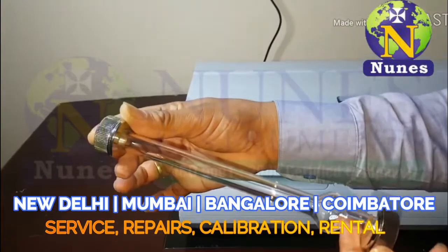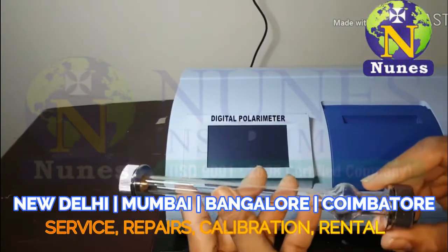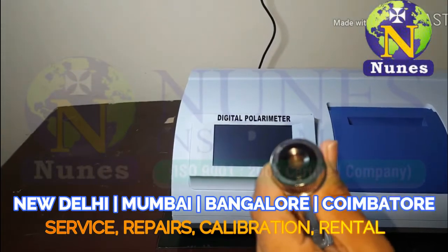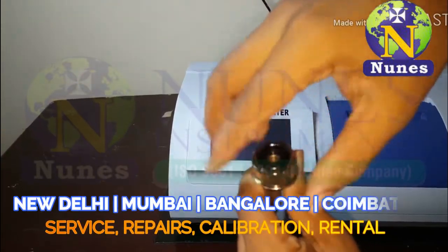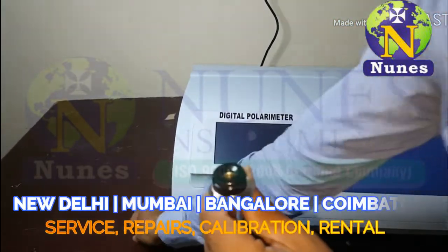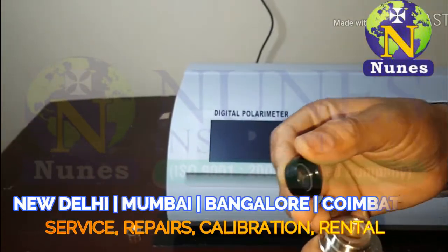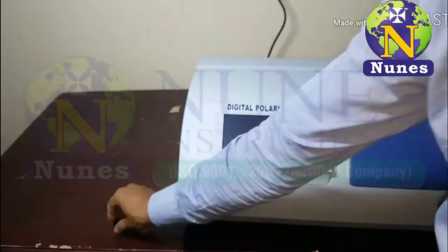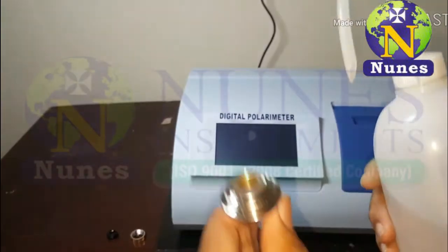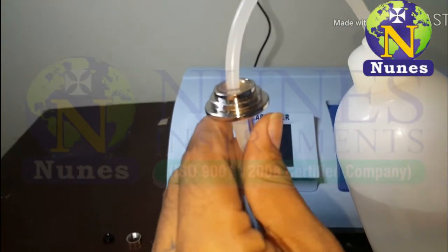Now we are showing how to fill the sample. Open any one side of the cap, then remove the optical glass. Next, fill the sampling tube up to the full limit.